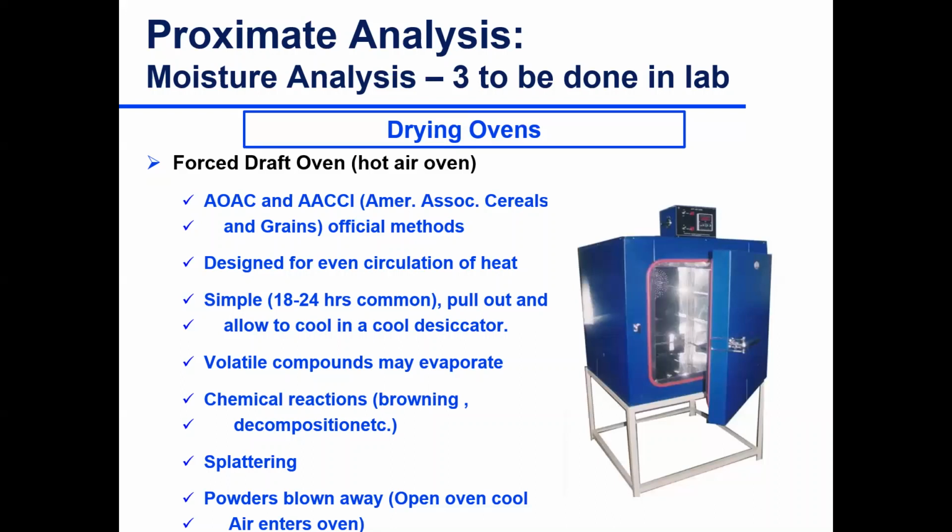The sample, of course, may have already been partially dried. Maybe it's a liquid. You don't want to toss it in there. It'll boil over perhaps. And so there may be some drying that's done beforehand and done carefully. And then once it gets to a certain point, you toss it, I should say, you put it in the oven gently, okay, and somewhere around 18 to 24 hours later, it will probably be taken out to the desiccator. And so this is a fairly common range. You use something like that time for the drying.